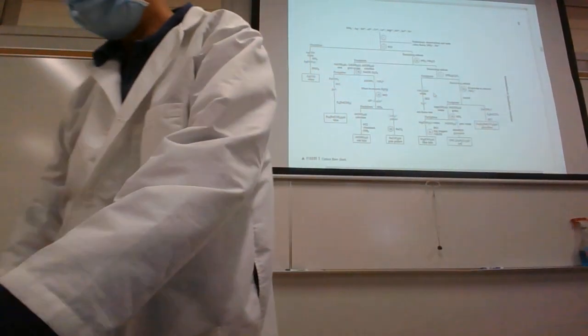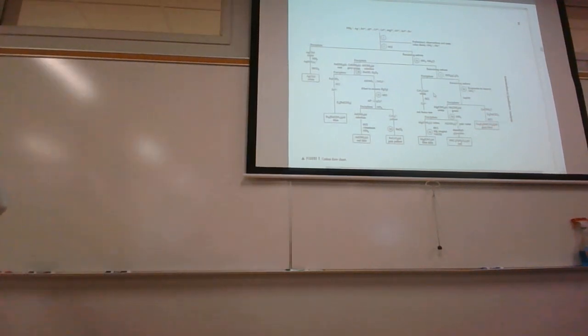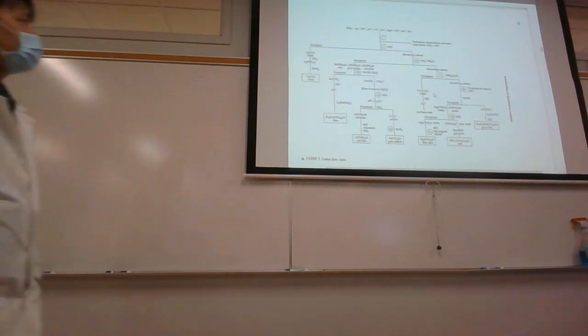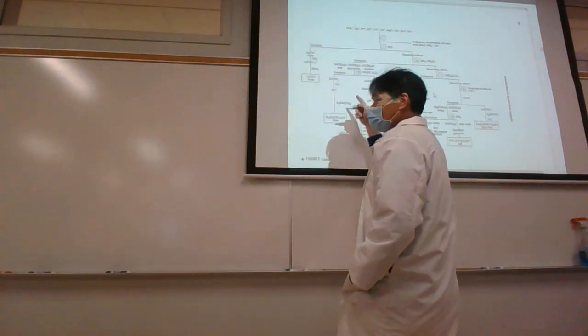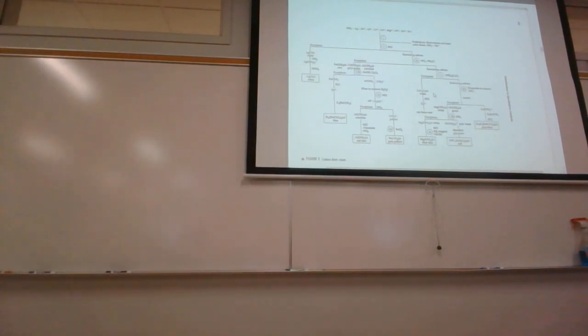All right, so the way we're going to do this with the known is like this. We'll take our known solution here. It's only 10 drops. And then I'm going to add the HCl. Now, how much HCl do I need to add? Okay, so when we add the HCl, this is what we do here. We add it drop by drop.